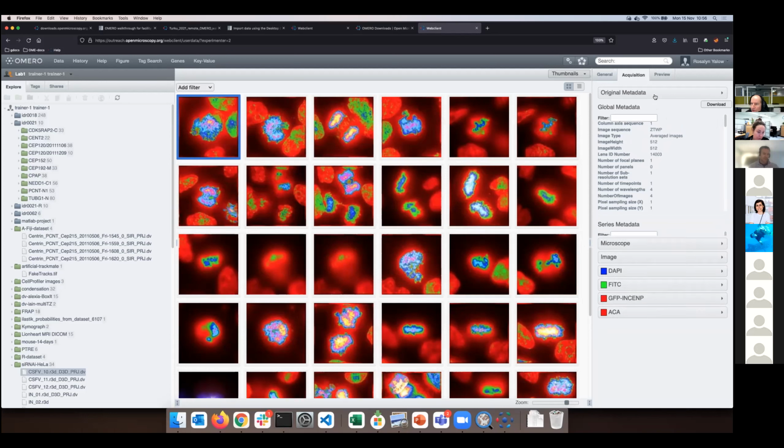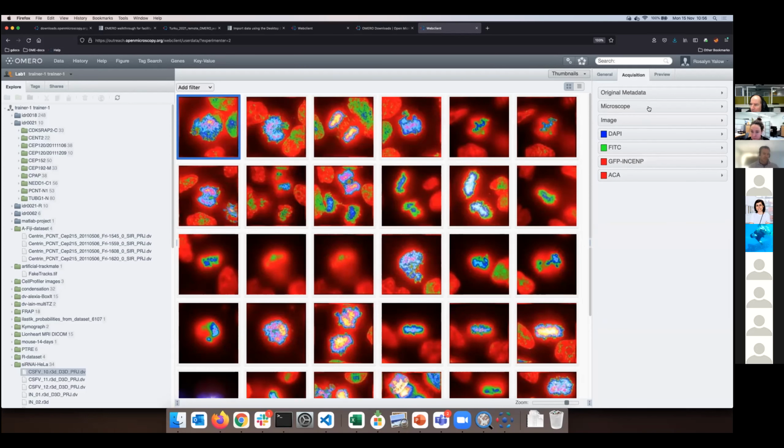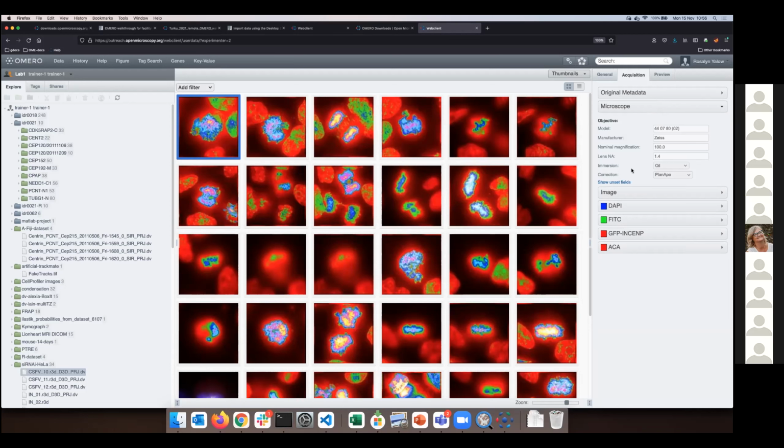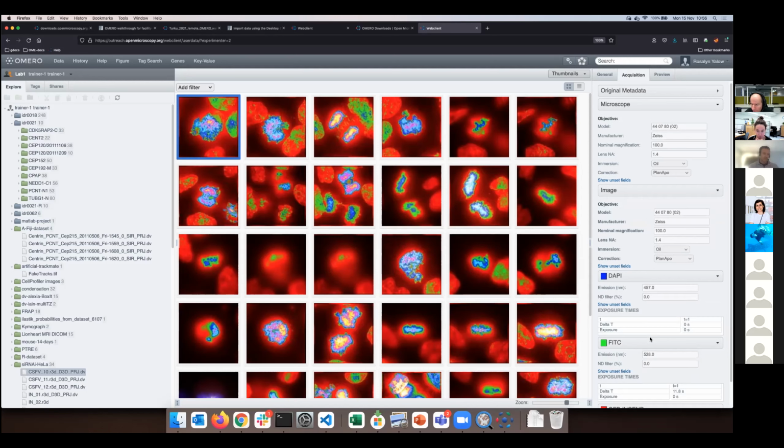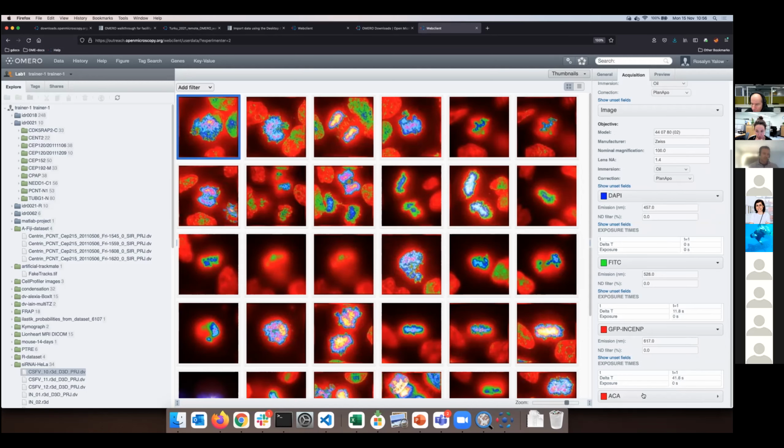So we wanted it to be more user-friendly, and that's why we have something called the OMERO Model. This is basically a schema where we know something about images, and if there is an item in the list called Microscope, we know more or less what it can contain as sub-items. We read that list and put it into the relational database I was highlighting in my talk, and then we put those data into those hierarchies where they are much more user-friendly, just like I'm showing you right now in the right-hand pane, and you can get the original metadata from here.